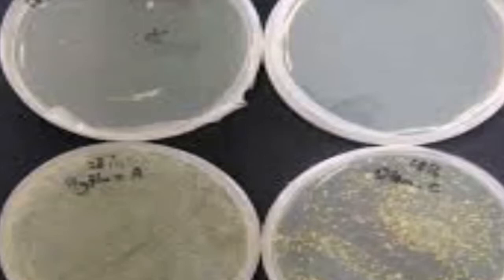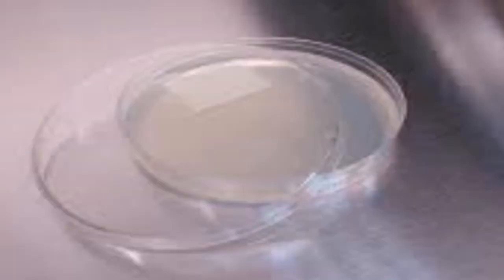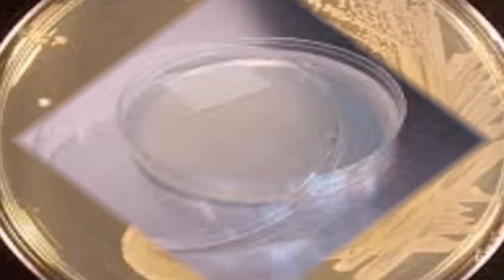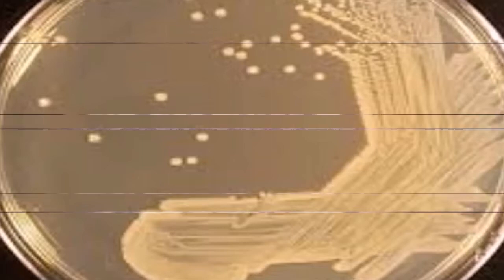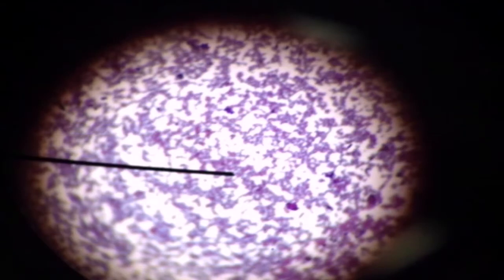We did a catalase test using hydrogen peroxide to determine if we had Staphylococcus aureus or Staphylococcus epidermidis. We used the hydrogen peroxide to see if our sample reacted when we combined the sample with peroxide. We had a positive reaction out of each TSA plate except for floor 3, sample 1 going out. We are uncertain as to the reason for the lack of this reaction on only the one door handle. If we used the TSA agar to determine what our sample was, we wouldn't have eliminated any of the possibilities with the catalase test.